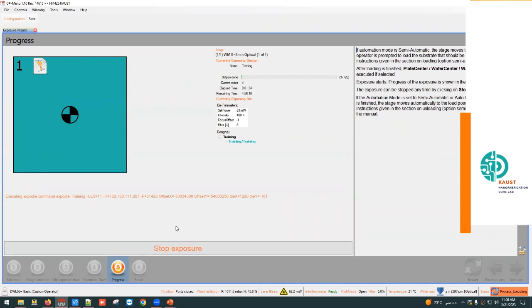One more question. Just now you showed we are using the automatic chuck, right? No, now we are using the chuck for manual loading. So is it a manual chuck or an automatic chuck? The chuck is not automatic. You need to change it manually.